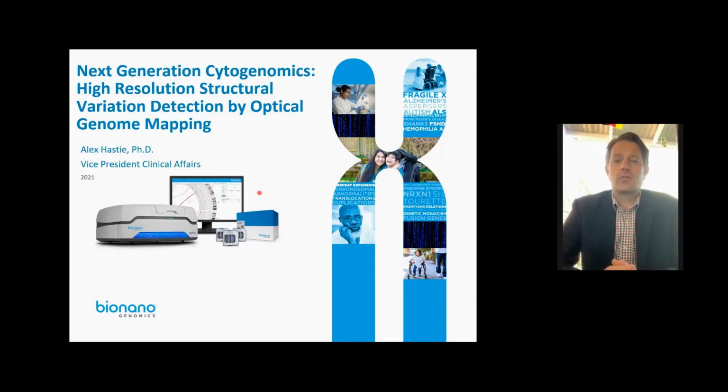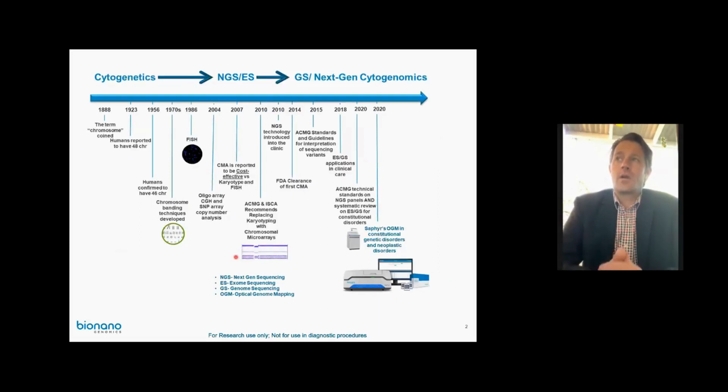And today I'd like to introduce the Bionano Genomics technology for optical genome mapping for the detection of high-resolution structural variation. I want to start off with a timeline to put chromosomal studies into perspective. The first observation of chromosomes and the naming started before 1900.